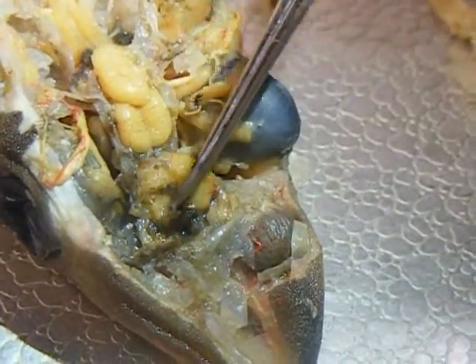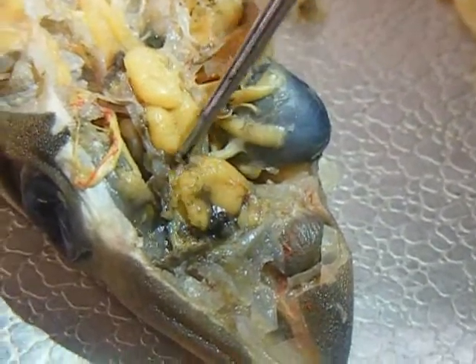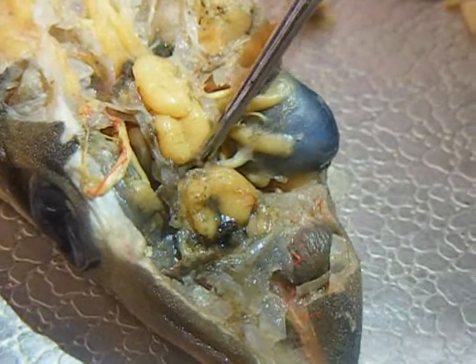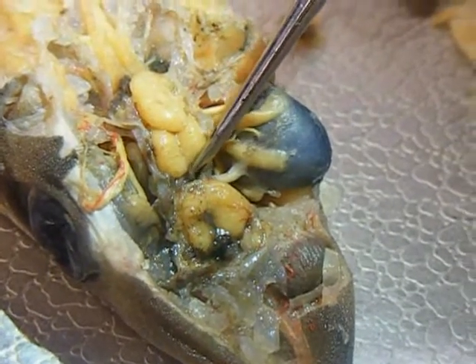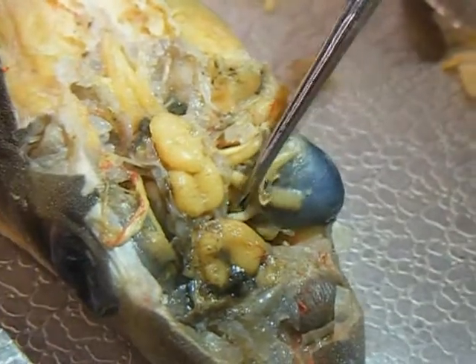Then you have the cerebral hemisphere. And then the epithymus. And then you have the optic nerve.